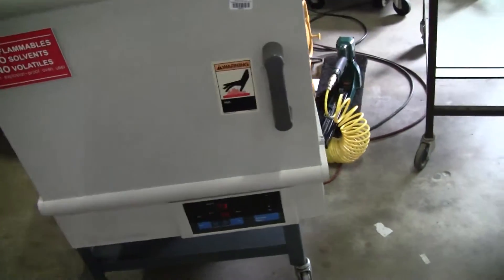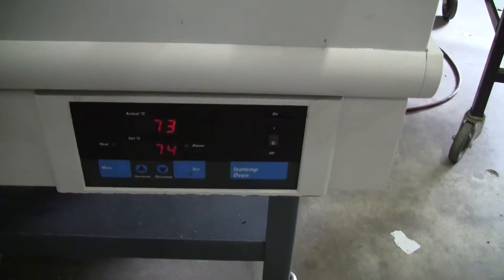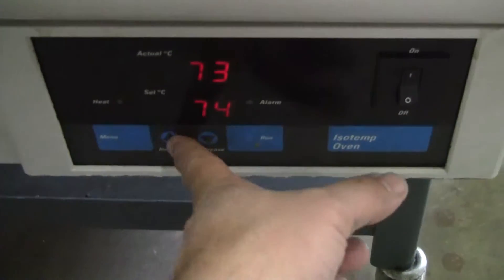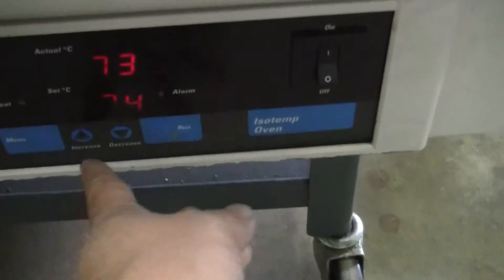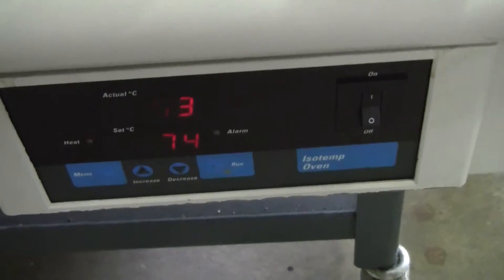It's kind of like a music video. Programmable controller. Please note this unit has seen some use, but it's in fantastic shape. You'll feel a little break in the membrane skin there, but it's totally functional.